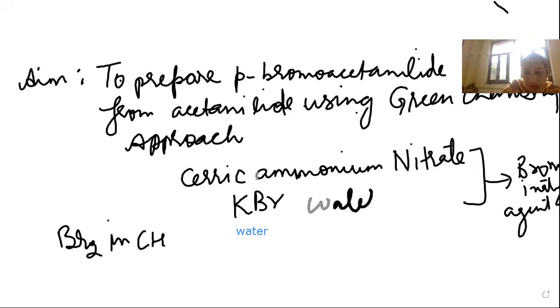and also we will be using ethanol. Right? So let us do the reaction involved in this case.